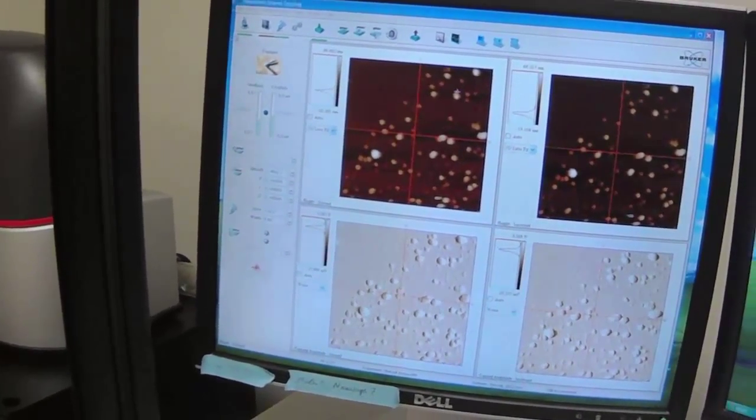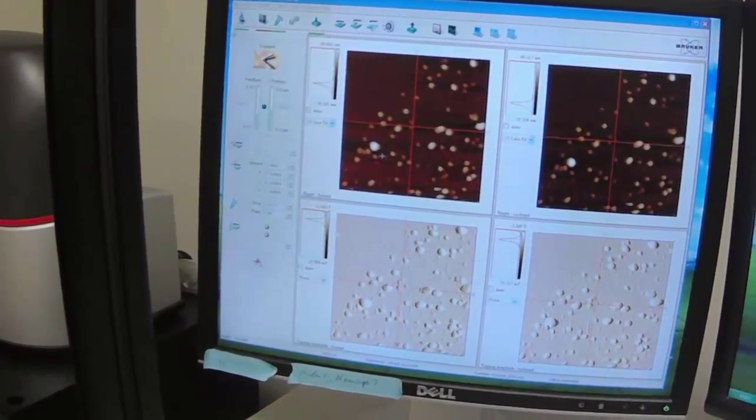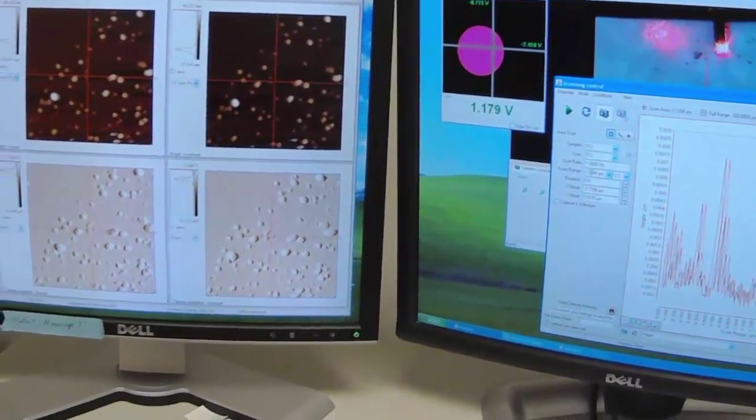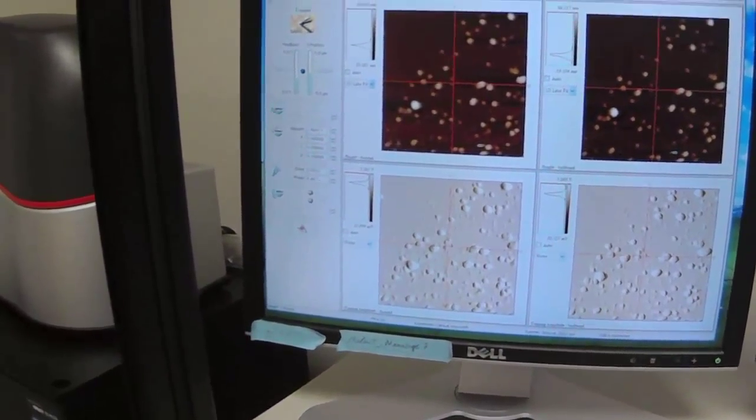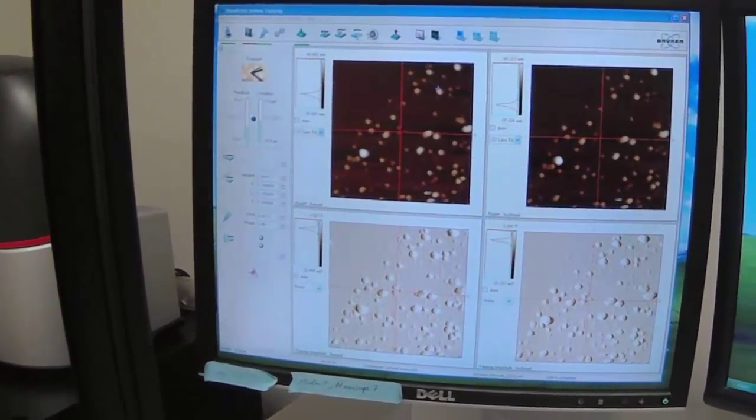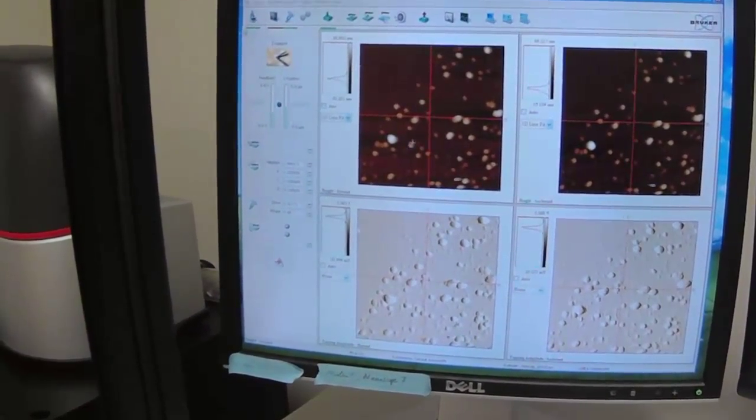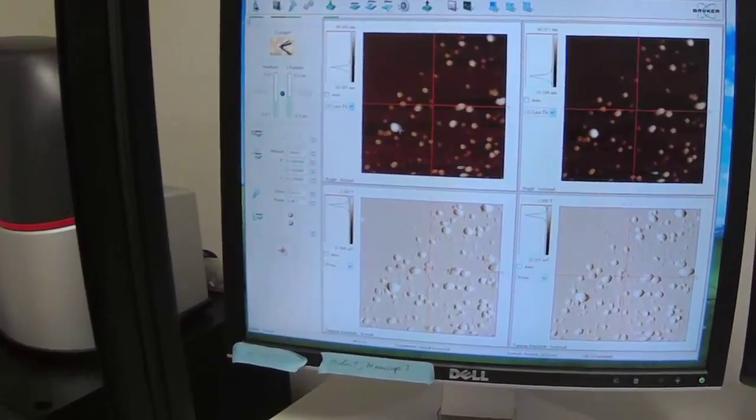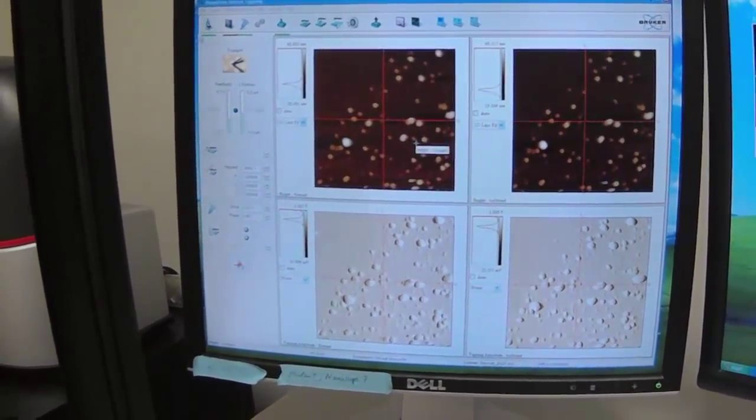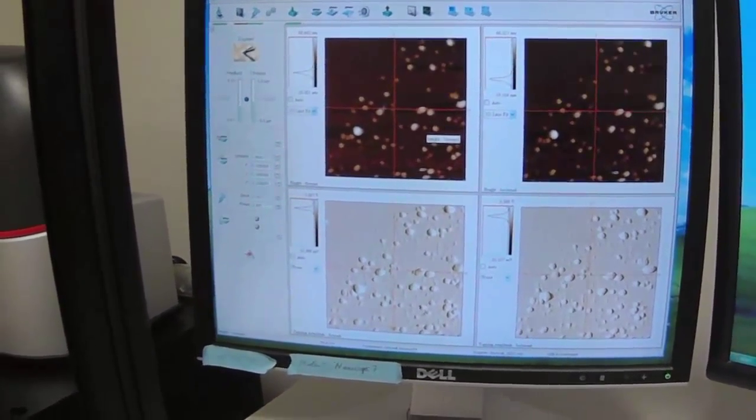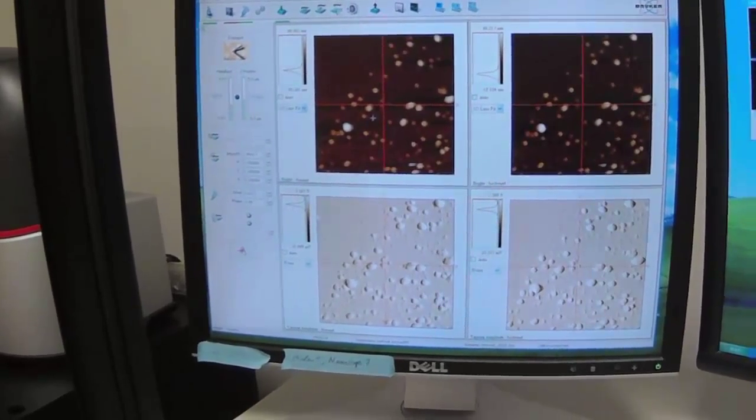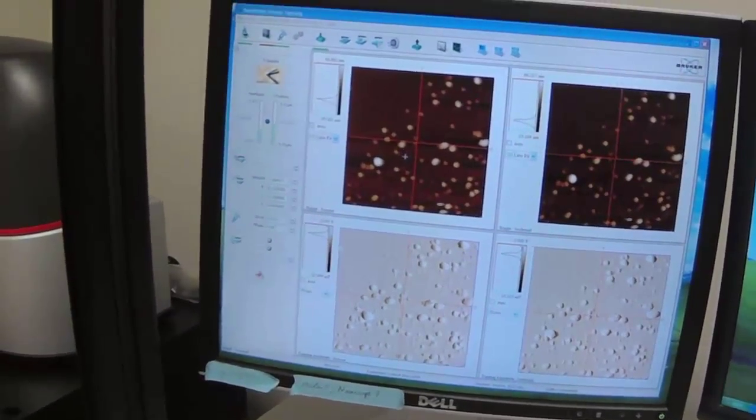Now that we've collected our zoomed in sample, about 2 micron by 2 micron image, you can see we have a series of bright spots which are round, so these are probably our spherical nanoparticles. We want to take this image into an analysis software so that we can perform the measurement.